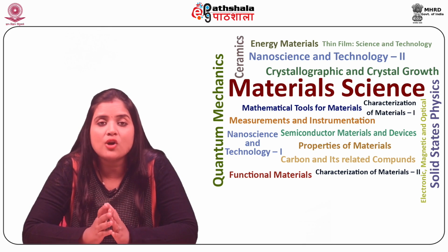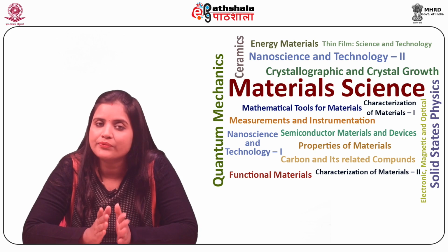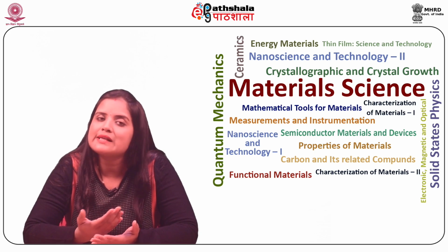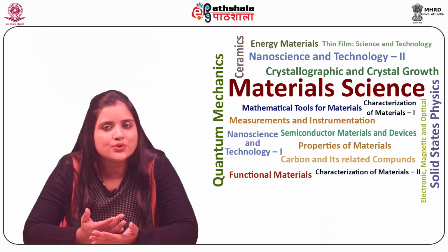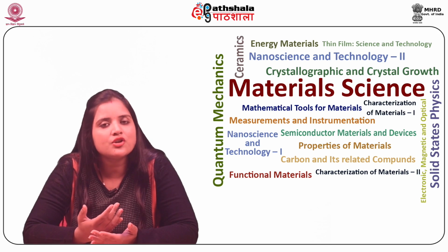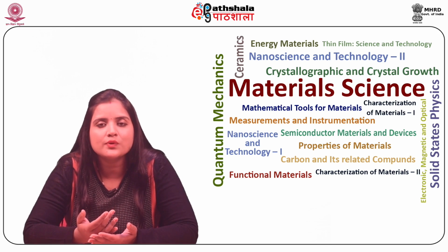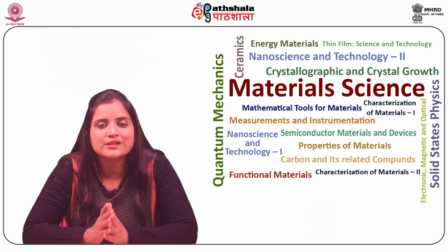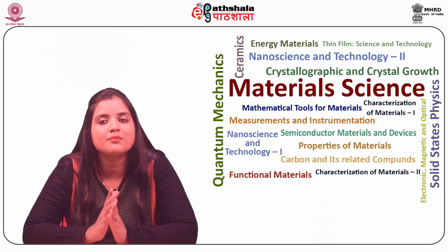Then, an important application is MEMS. Comb drive actuators, micromirrors, accelerometers, gyroscopes, micropumps, microphones, ultrasonic transducers, cantilevers, surface acoustic waves, etc. have been analyzed via digital holography microscopes.